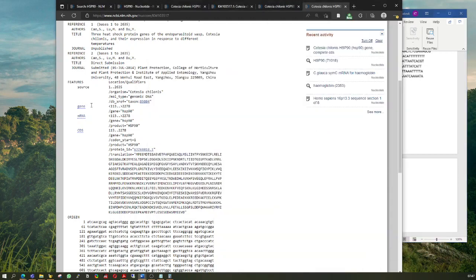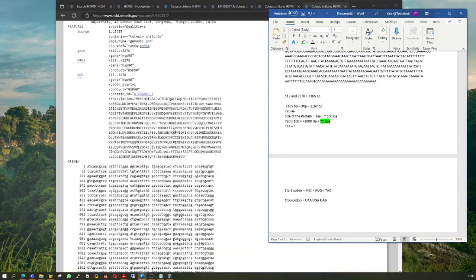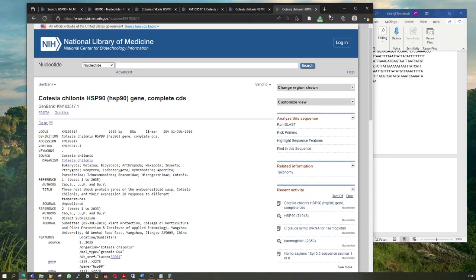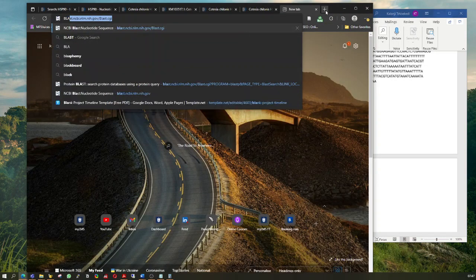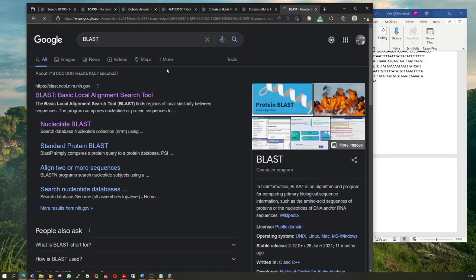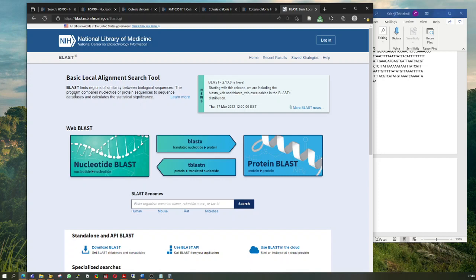Okay, I hope that this really made sense, and maybe we're going to use another 2 or 5 more minutes to just introduce BLAST as well. Well, NCBI BLAST is one of those very interesting algorithms. So if you just go on the internet and search NCBI BLAST or BLAST, there's a high possibility that you're going to land on this page. BLAST stands for Basic Local Alignment Search Tool. And of course, there's a nice definition here: finds regions of similarity between biological sequences and all that.